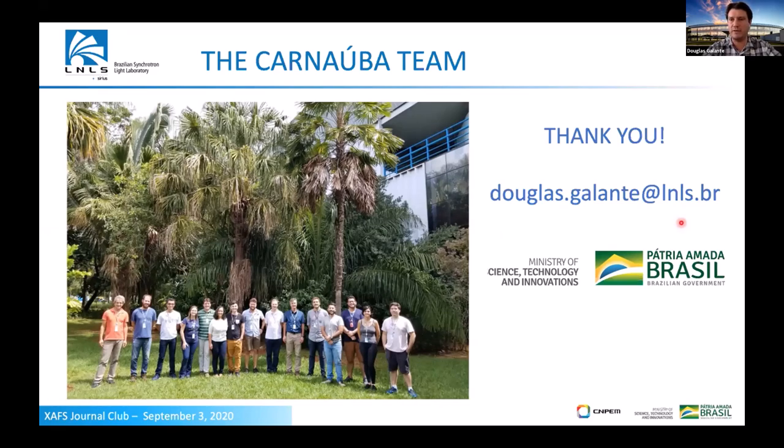We are doing a lot of work also on the laboratory of sample preparation. So we are putting in a FIB to prepare thin lamella and pillars for mapping, X-ray absorption, quantitative fluorescence and X-ray absorption, and also CDI. And we're doing a very big effort also on data treatment. So we have a special group doing computer sciences and putting together HPC machines so that data treatment can be done in situ in our lab as well. So thank you very much, guys, and I'm here for questions.